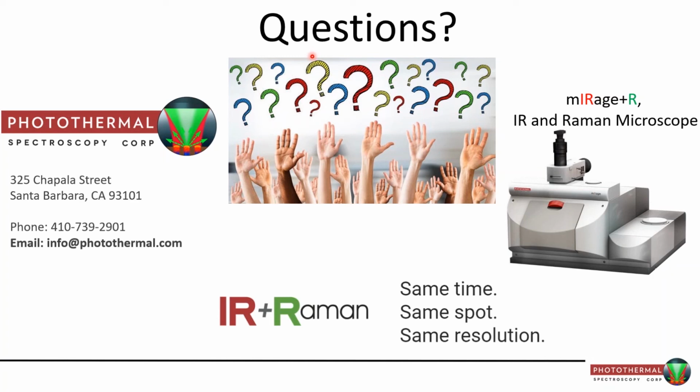One of the nice things about the system is that we've used it with as small as a 50 to 100 nanometer step size when mapping, and we've been able to resolve that fairly well, which we're quite excited about. Some of those phase separated particles, with the organic on the outside and the inorganic in the middle, we've been able to see quite nicely down to that 100 nanometer or so spatial resolution. Thanks, Andy. That correlates pretty well with some of the earlier stuff I showed with the polymer dispersions, where I was easily seeing things in the 200 nanometer range.